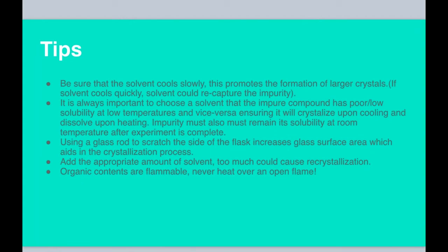It is always important to choose a solvent in which the impure compound has poor or low solubility at low temperatures, and vice versa, ensuring it will crystallize upon cooling and dissolve upon heating. Impurity must also remain soluble at room temperature after the experiment is complete.